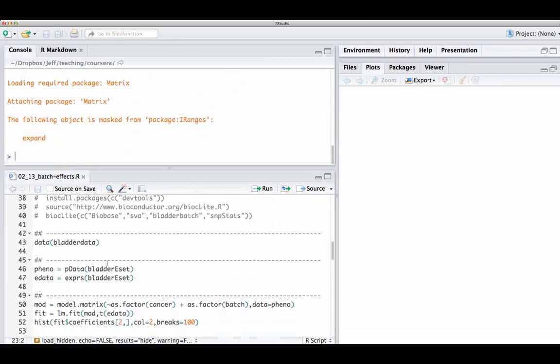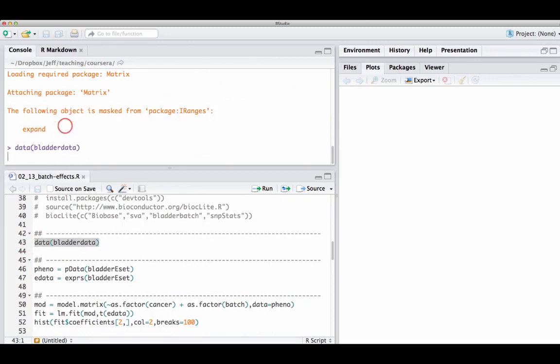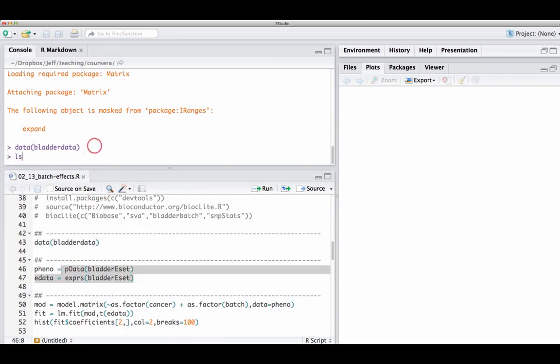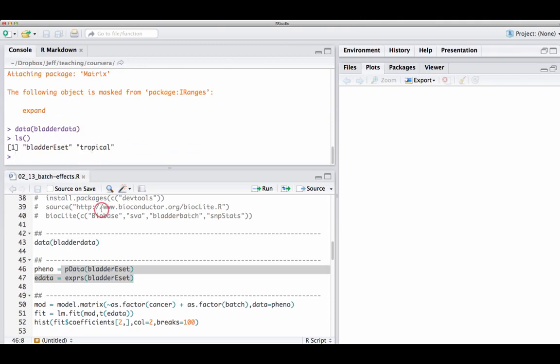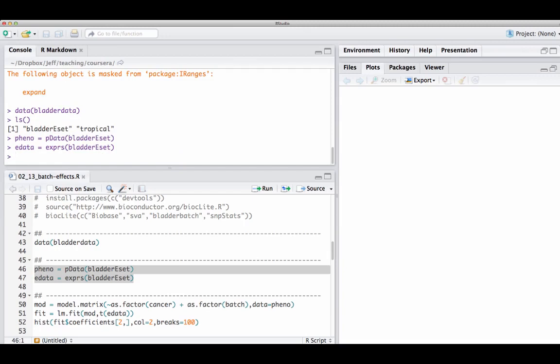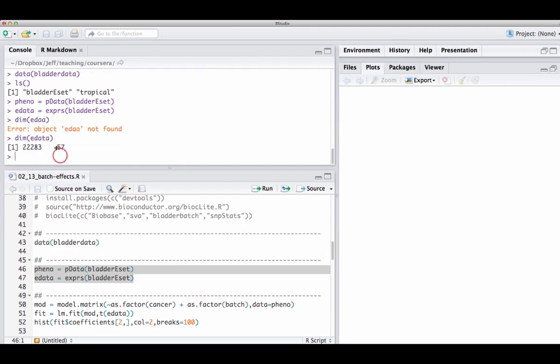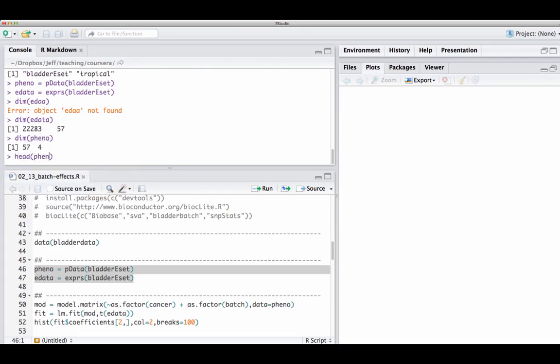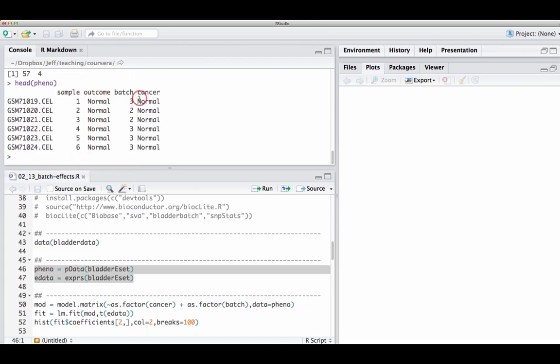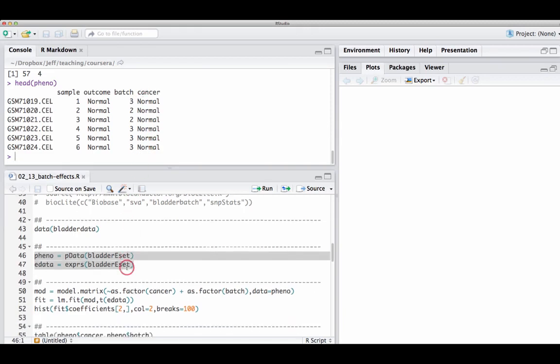I load those packages, and then I'm going to load this bladder data set. I have an expression set — a bladder expression set. I'm going to extract the phenotype information and the expression information from it. Now I have an expression object that has 57 samples in it, and some information on the phenotypes. In this case, I have information on the outcome, the batch variable, and whether it's a cancer sample or not.